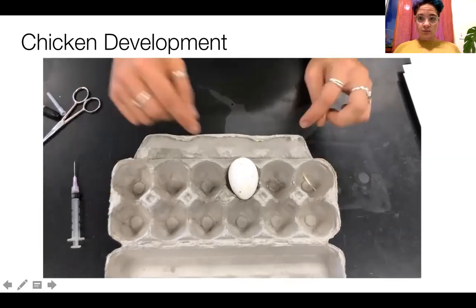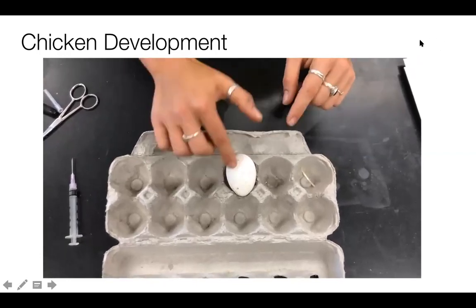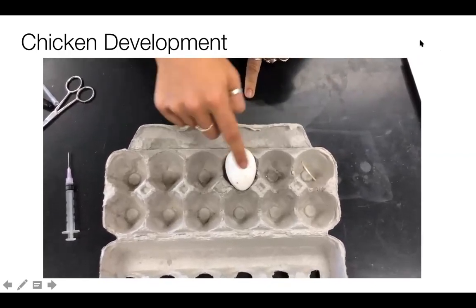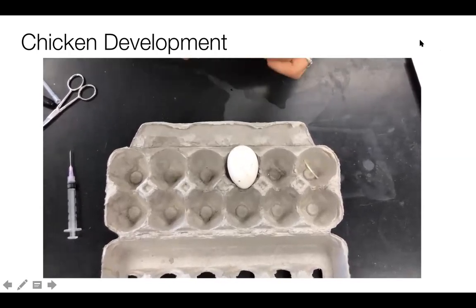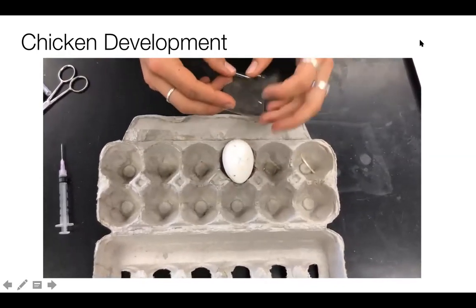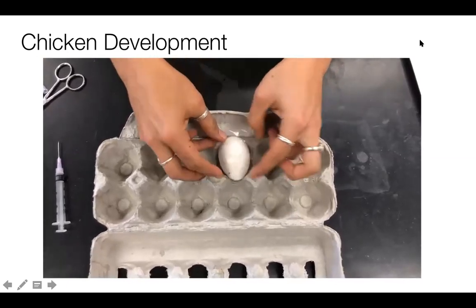Okay, I'm going to show you the tips and tricks to make a window on our chicken egg. The first thing is that the TA should have marked a pencil X on your egg. This is where the egg yolk is going to be. That's going to be important later on, but first we'll take the tape that the instructions tell us to. This tape is going to help reduce any cracking of the egg, so it's important to put it on. So we'll put one piece right above the X.